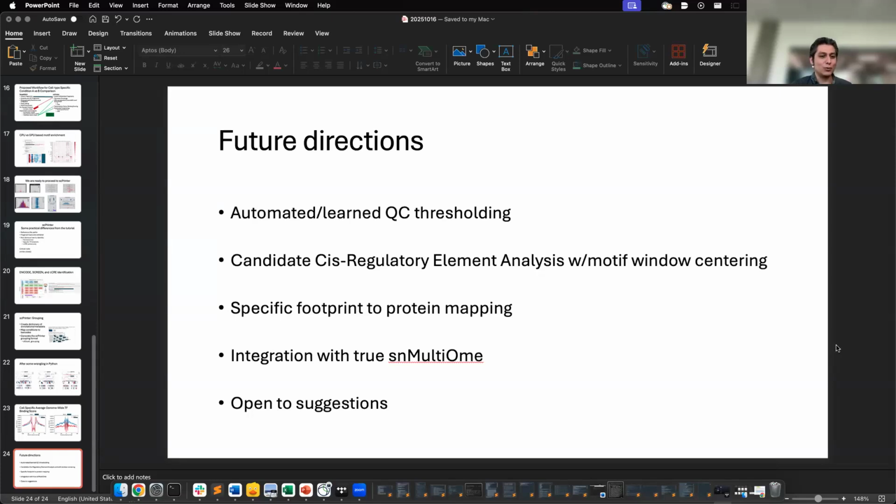But I do know that because Muon has the capacity to integrate both your ATAC and your RNA-seq signal, and SnapATAC gives you a way to QC that data in Python, I am making the bet that it will be easier to move into Muon, given that it is also based off of AnnData and those data structures.